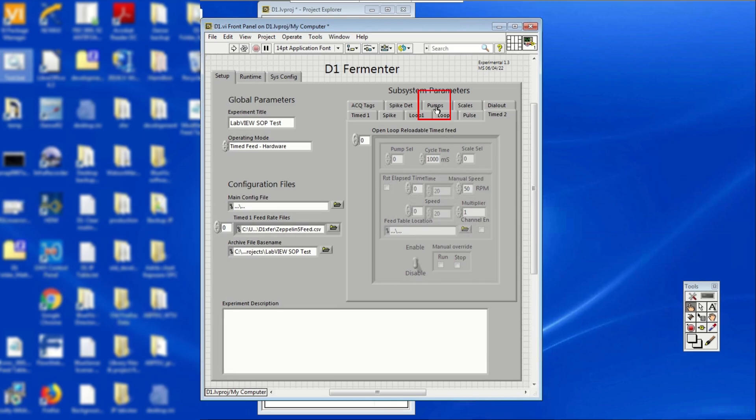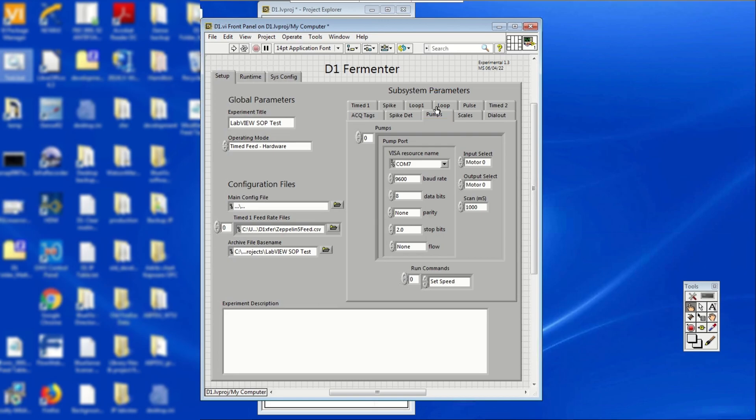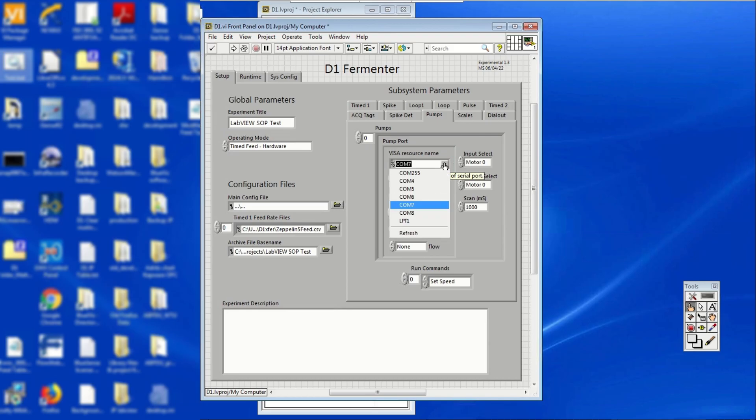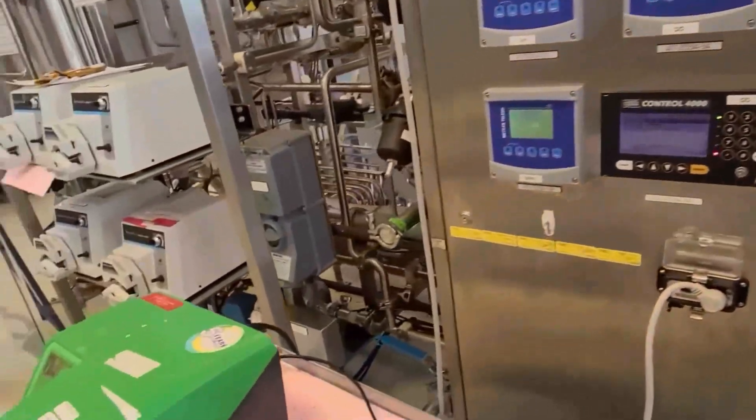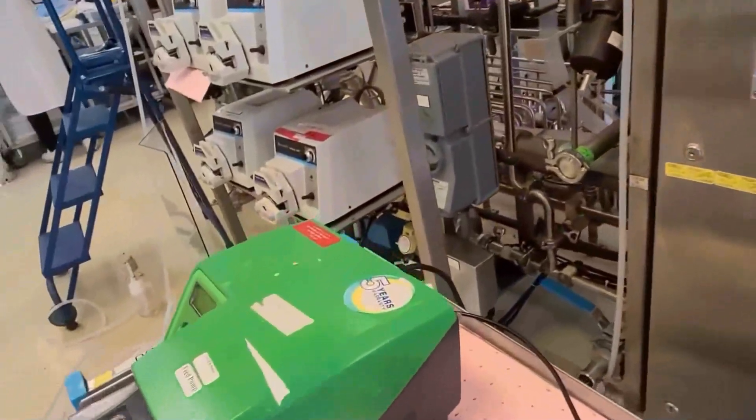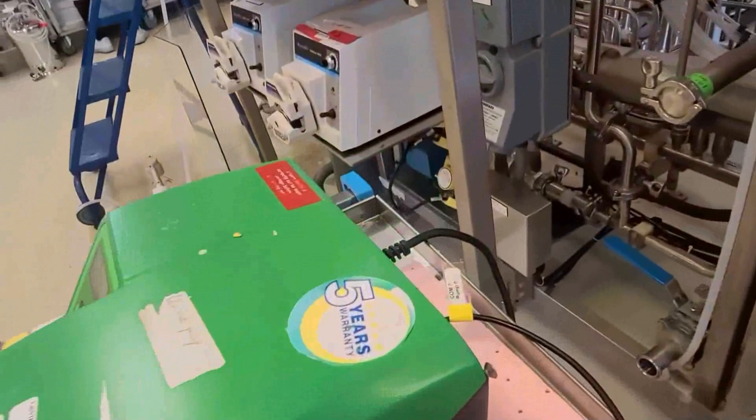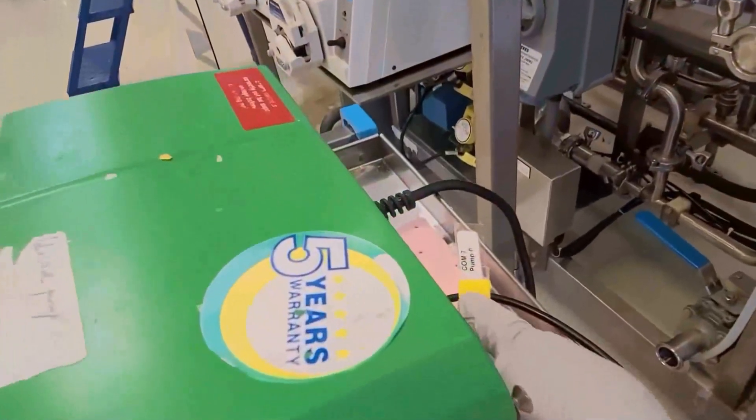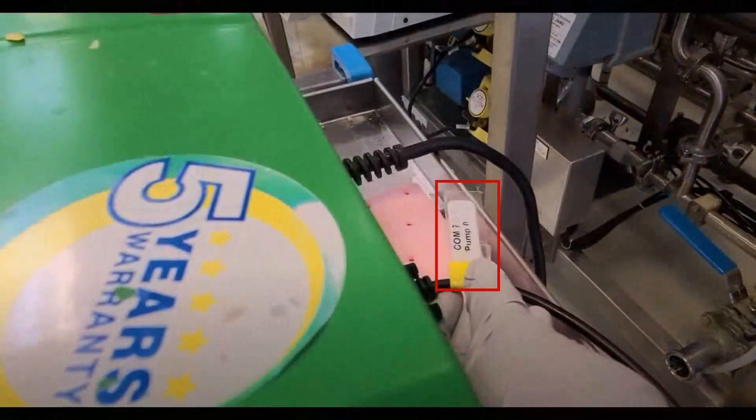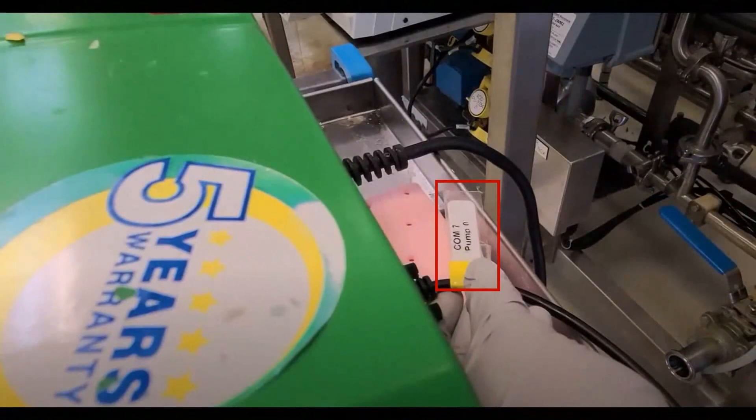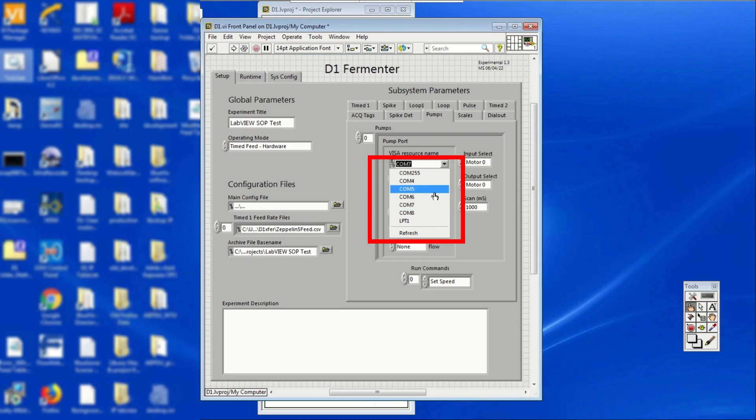On the left-hand side of the front panel, under subsystem parameters, click pumps. Each pump that can communicate with LabVIEW has a VISA resource name. Look for the name tag wrapped around the cable of the physical pump. Under the visa resource name, click on the drop down menu, which has a downward arrow. Select the name of the pump you are using.